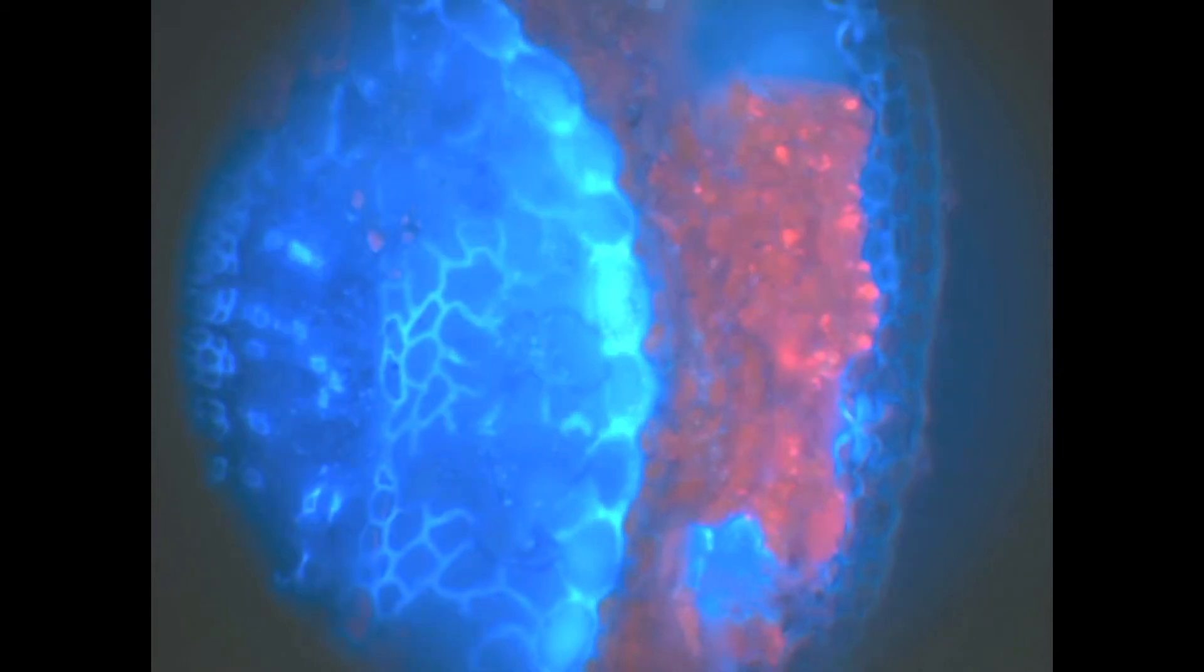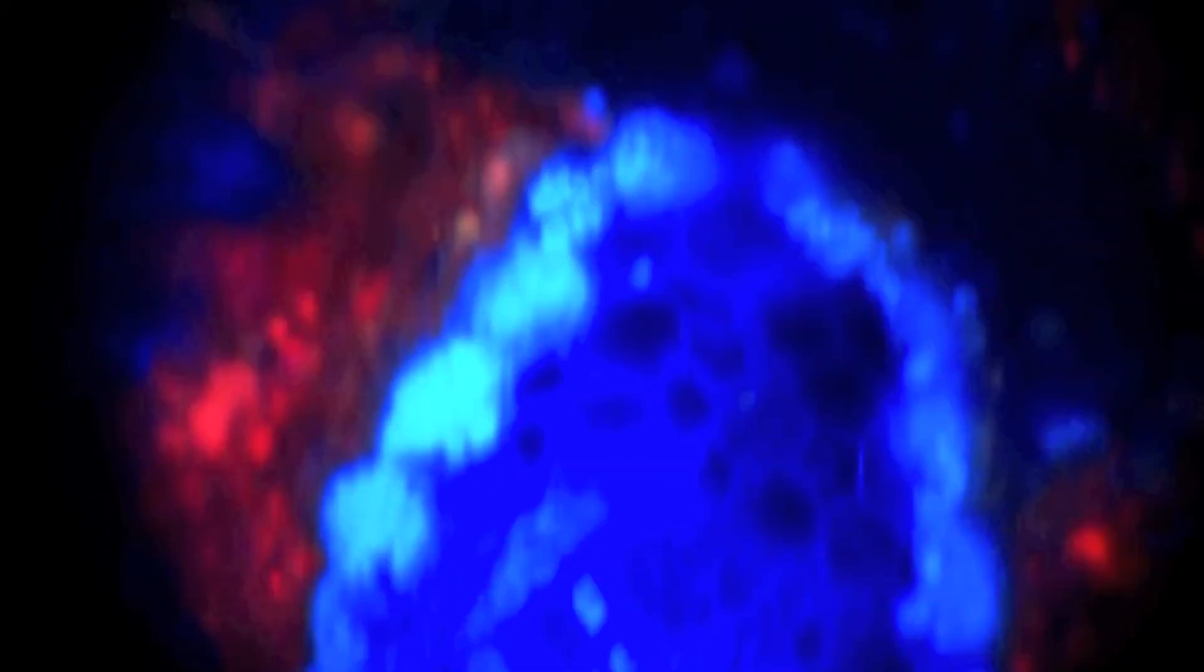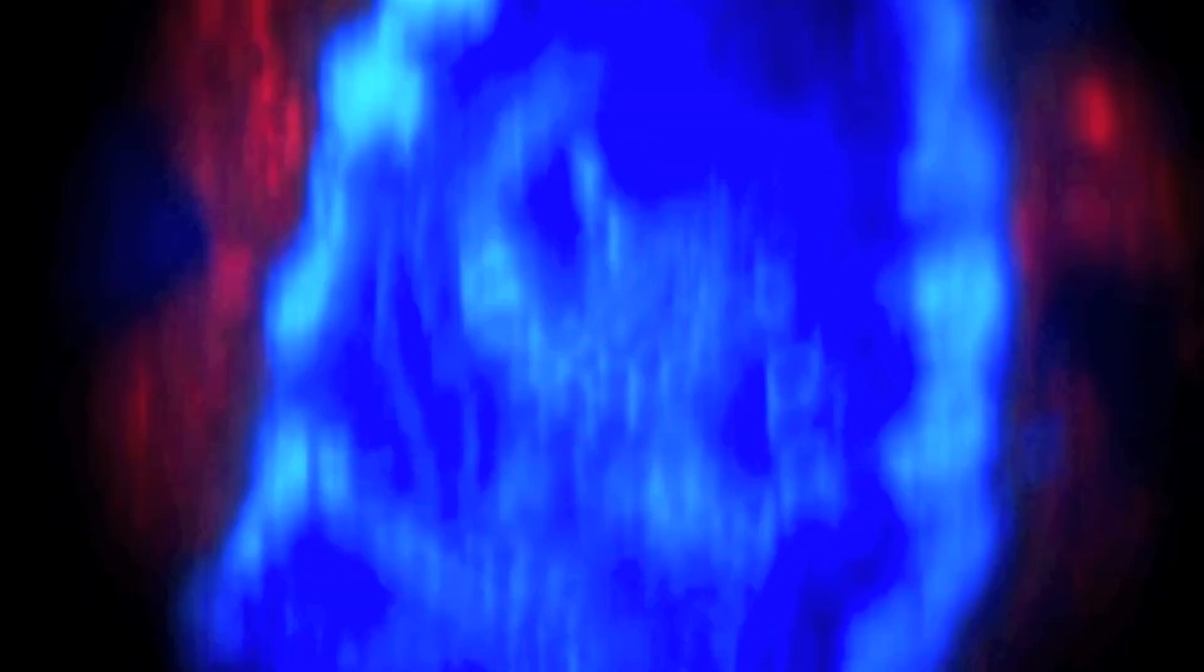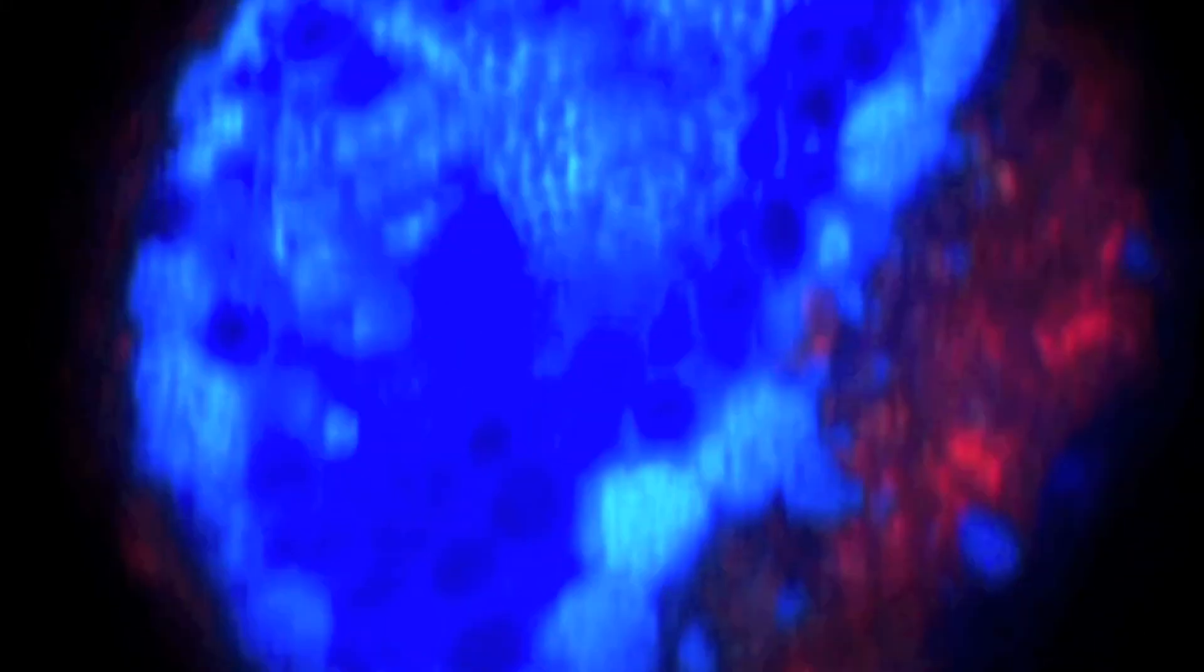So let's start in dark field with a live specimen and go to fluorescence. You see the vascular bundles in the center. Off to the right side are those red chloroplasts. If we go up in magnification a little bit, you see the red chloroplasts glowing. We'll go up again a little higher. Red chloroplasts and those beautiful resin canals glowing blue. It's also fun to get your lighting set up and then just glide over the top surface of your specimen. You can see the beautiful chloroplasts glowing red and orange. The resin canals glowing that eerie blue. The center vascular bundles with that eerie blue. Just really pretty to look at.